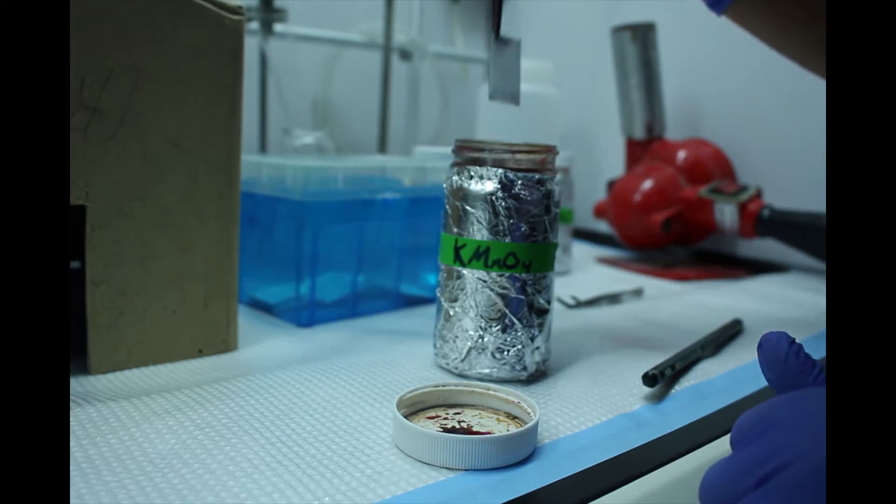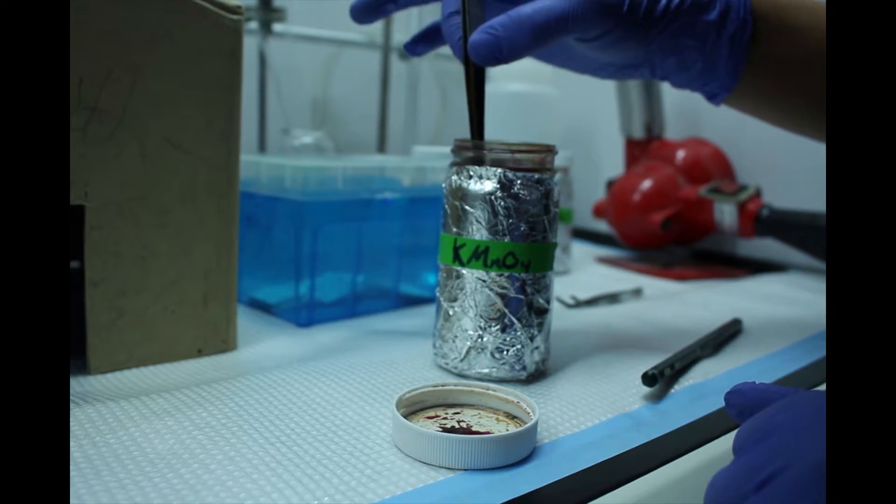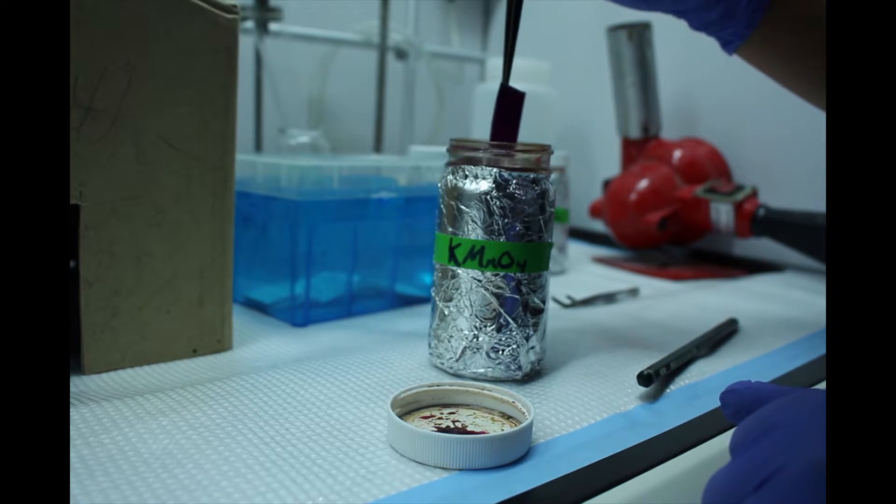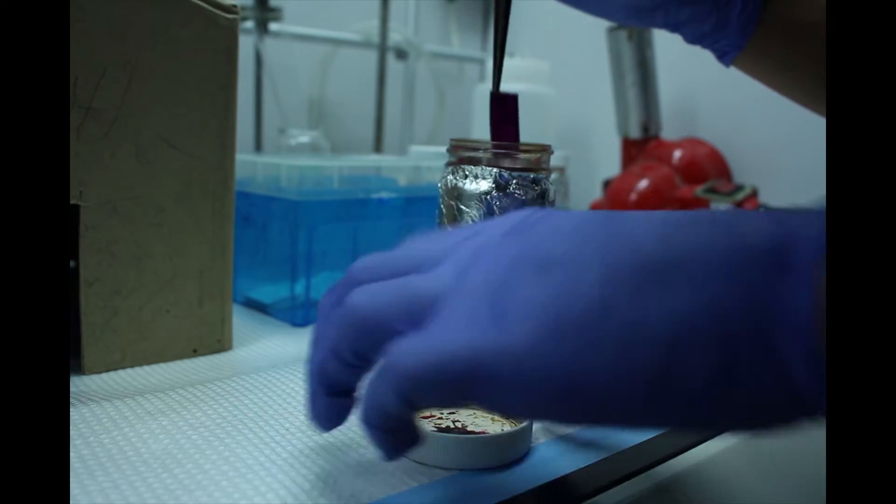Next, choose a stain based on the functional groups of your mixture to further visualize your TLC plate. Only one stain may be used per plate. We will use potassium permanganate.